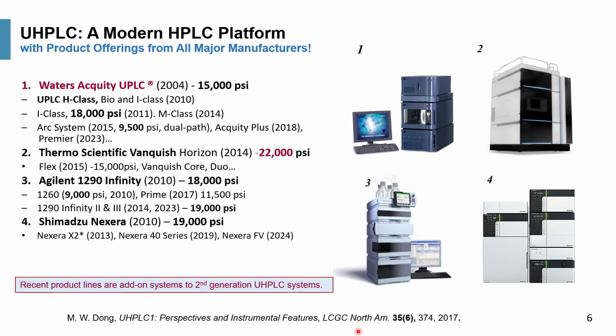Now, the first commercial system actually debuted 7 years after that 1997 paper. And I was told that Professor Jorgenson was a consultant with Waters. And Waters in 2004 had a breakthrough introduction of the Waters Acquity UPLC, which is a registered trademark for ultra performance LC, 15,000 psi.